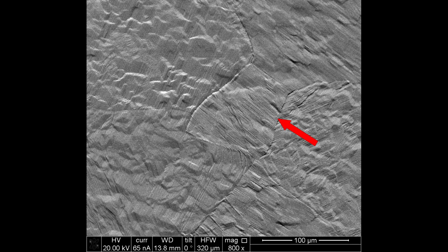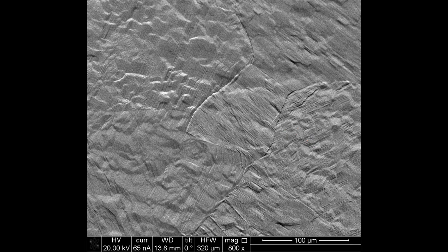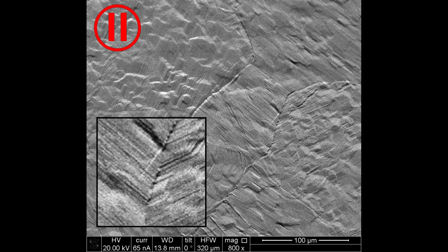First, you can see a single alpha lath nucleating on the central beta grain boundary. Usually multiple lamellae are described as nucleating together as a colony and then moving as a front into the grain. Clearly, at least for Ti-6-4, that is not what happens, at least at these cooling rates.